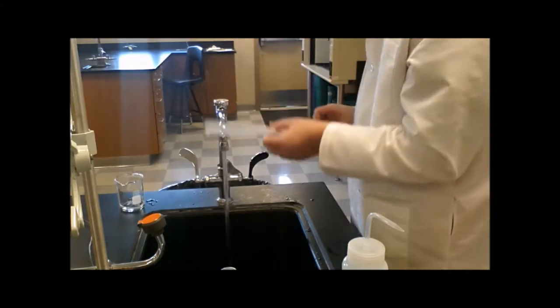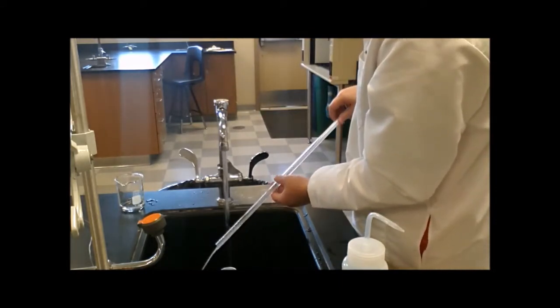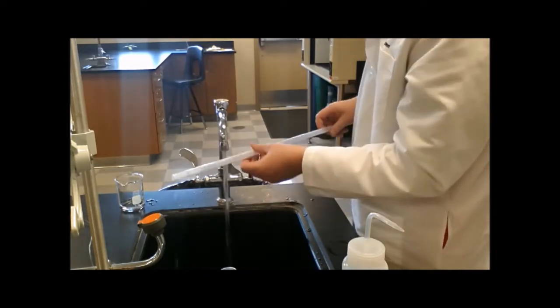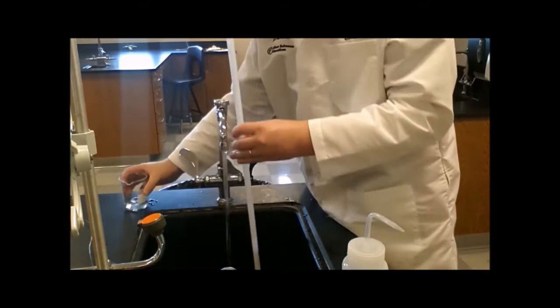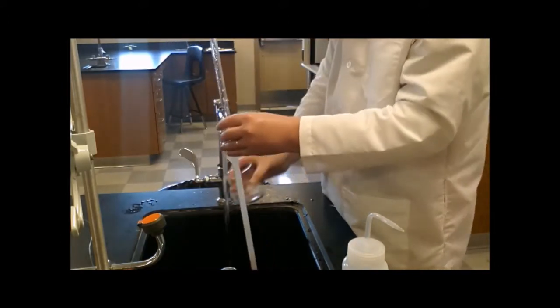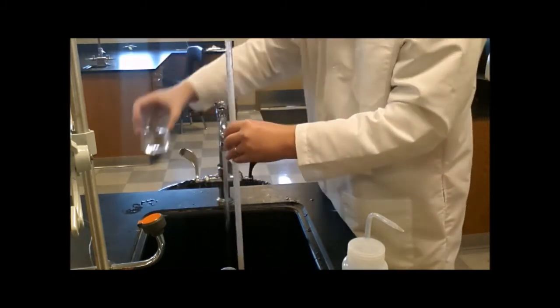So you can rinse. And see how I'm twirling it while I'm rinsing it out? Always twirling, twirling, twirling towards freedom. If I twirl it, I get all of the sides down. So I'm going to rinse it.